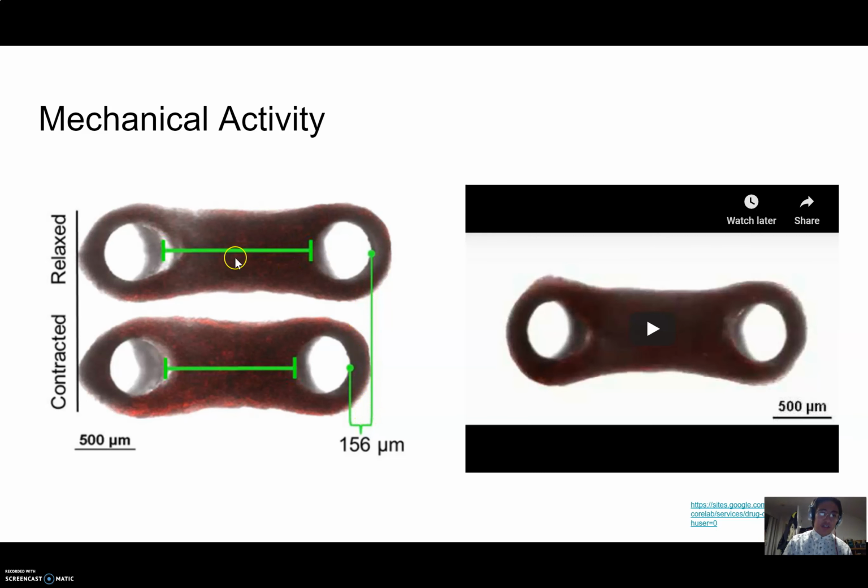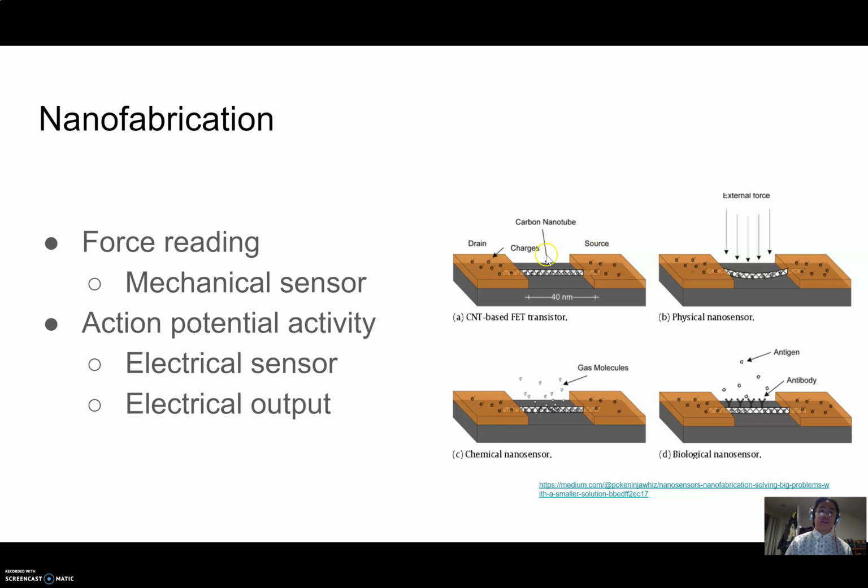So basically, my project had to deal with how to collect this data without doing the tedious work of doing all the analog inputs of analyzing the data afterwards. Because the MATLAB was able to capture information, you still had to interpret and extrapolate other information from the data. And I decided that we would go the route of nanofabrication, which is pretty cool.